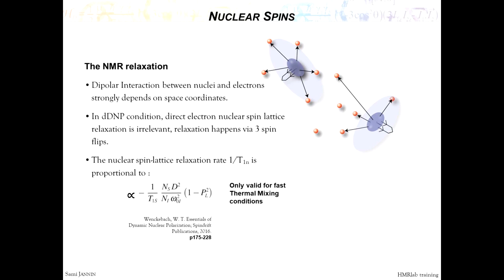for carbon. Actually, we don't measure relaxation at 1 Kelvin. We always go at 4 Kelvin so that the polarization of the electron goes down and there is some relaxation. Otherwise, it's just insane how long it is. Did we ever measure the carbon relaxation at 1 Kelvin? Or?